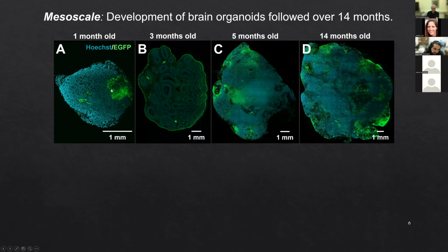In the first one, we can see that the cells are clustering in one part, but we cannot get the same conclusion if we only look at optical slices. If you work with 2D slices, you will not be able to conclude if the cluster is still there or if there is an even distribution of the cells in these samples.